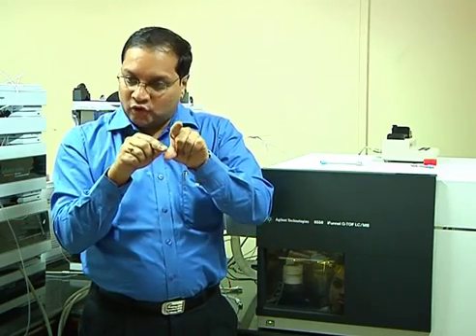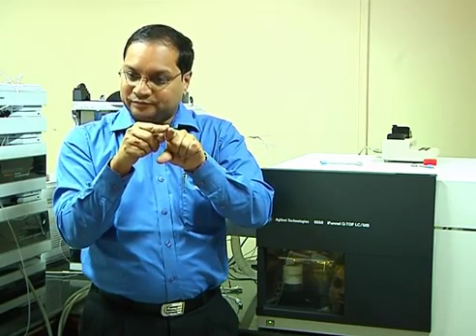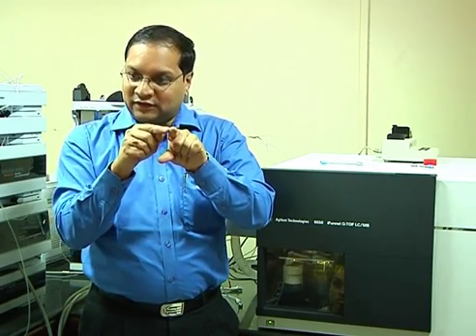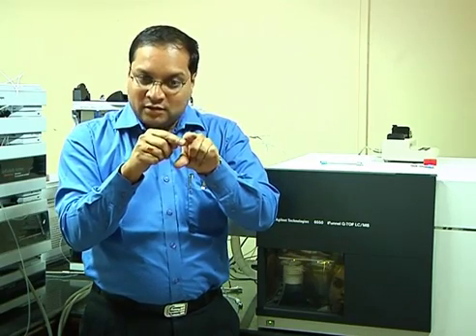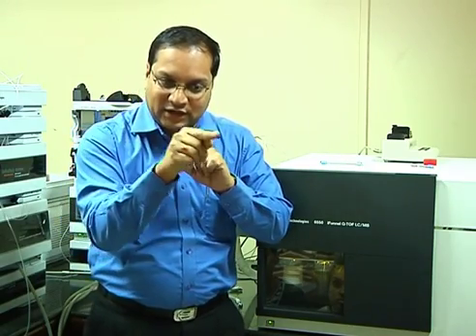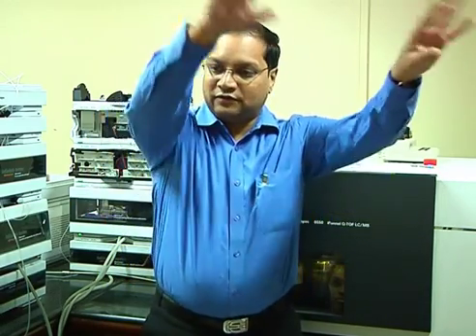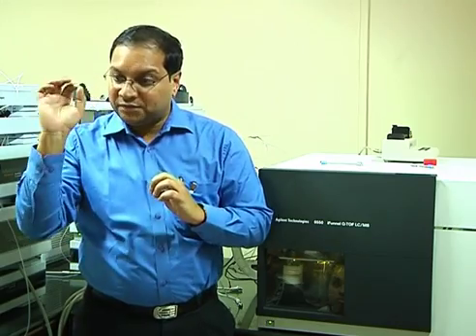So the moment it comes close, the polarity switches. This becomes DC, this becomes RF. So now this, instead of attracting, will repel 500, and this will attract. So it will travel like this. During this, probably the other 5,000 will get hit here and get lost. Then again polarity switches. Then it comes here. So like that, it will try to travel in the quadrupole selectively, and the other 10,000 will hit somewhere or the other and get lost. So in this way, you can filter mass with very high specificity.